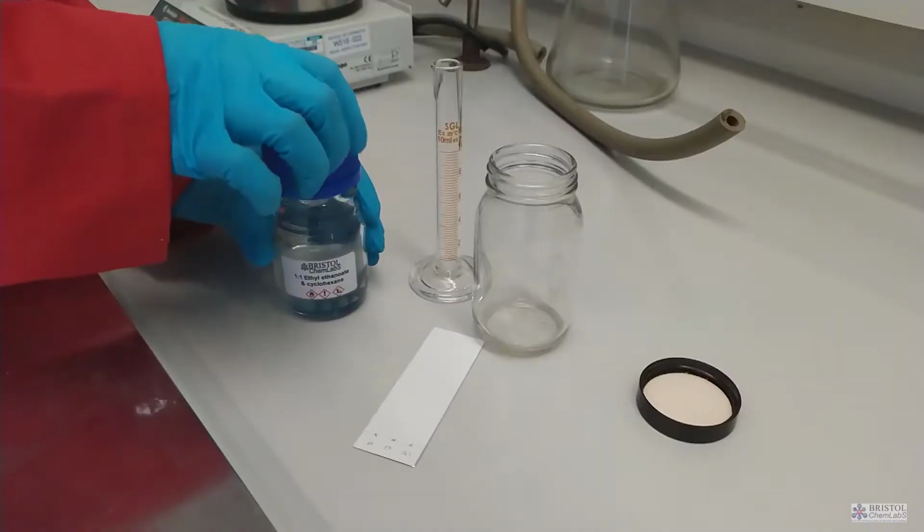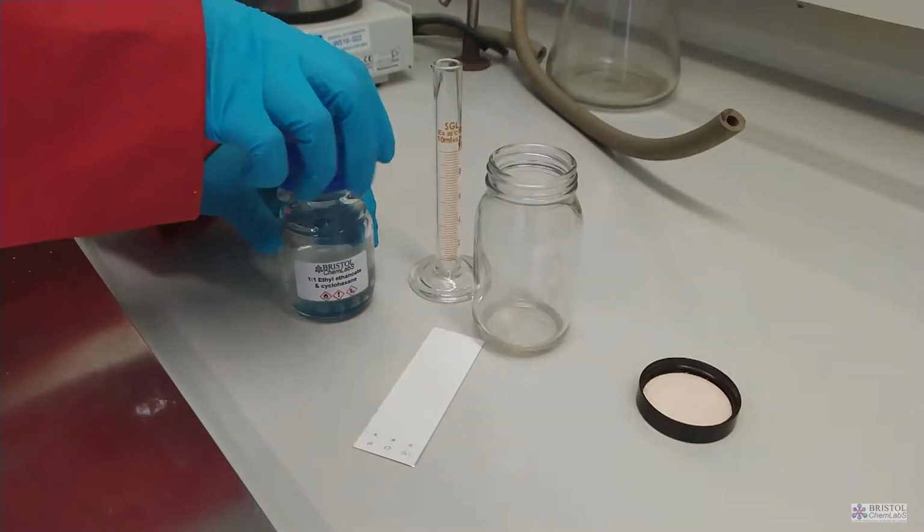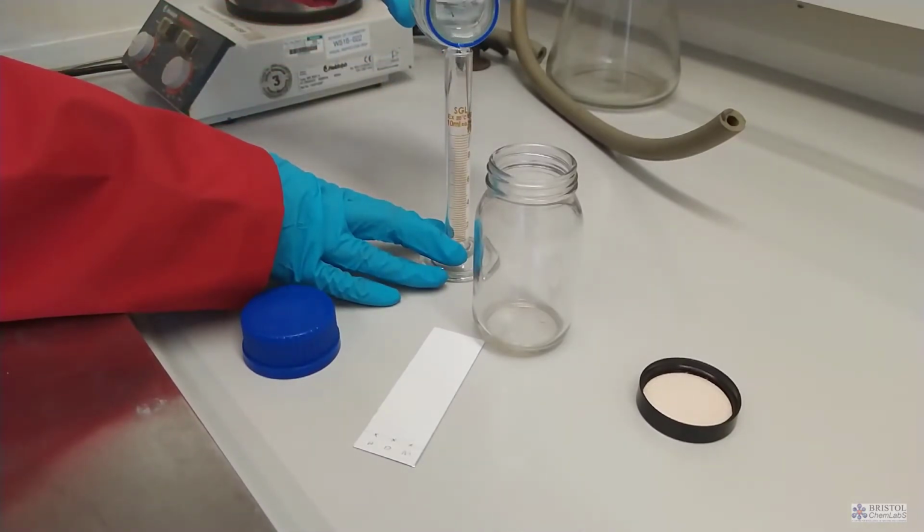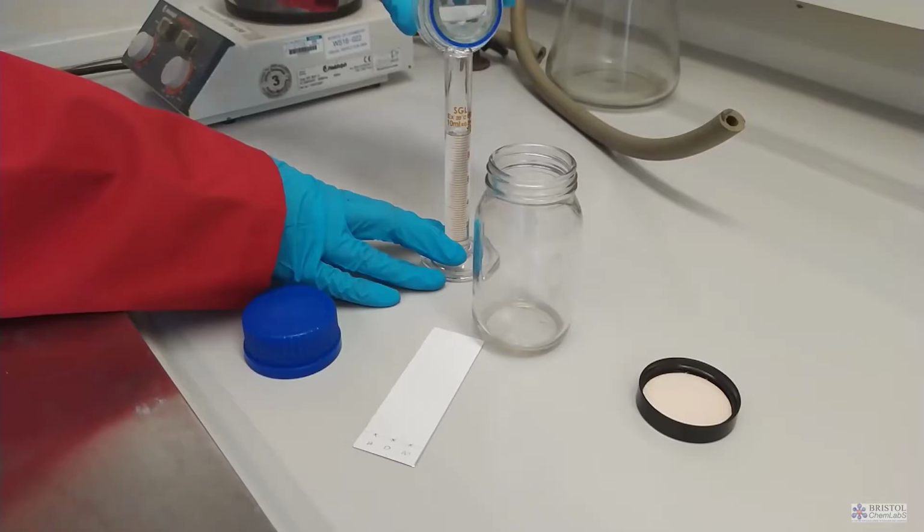The plate then needs to be put in a sealable jar with some appropriate solvent. The solvent mixture is ethyl ethanoate with cyclohexane in it. Ensure that the solvent level starts below the pencil line, otherwise the sample will simply dissolve into the solvent.